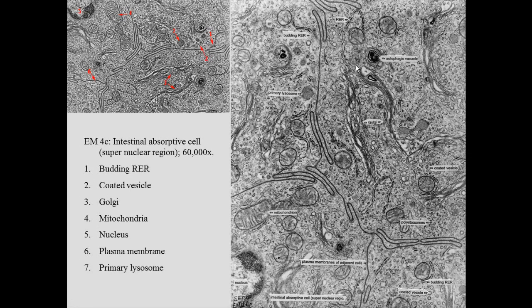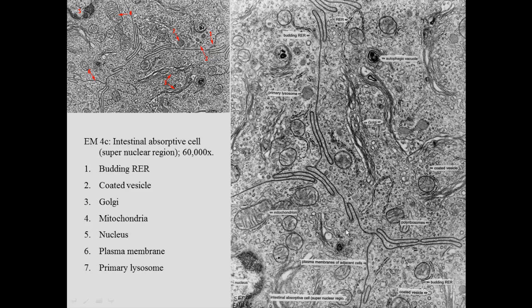The microfilaments are actually what pushes the plasma membrane out and makes the microvilli. If you come down from the surface of a cell a little, you see a lot of Golgi apparatuses. One Golgi, there's another Golgi, another Golgi. A Golgi looks like a series of pancakes that's been cut. A series of flattened vesicles is what we see with the Golgi apparatus. And these are membranes between two cells. This is actually two membranes, one from that cell and one from this cell.